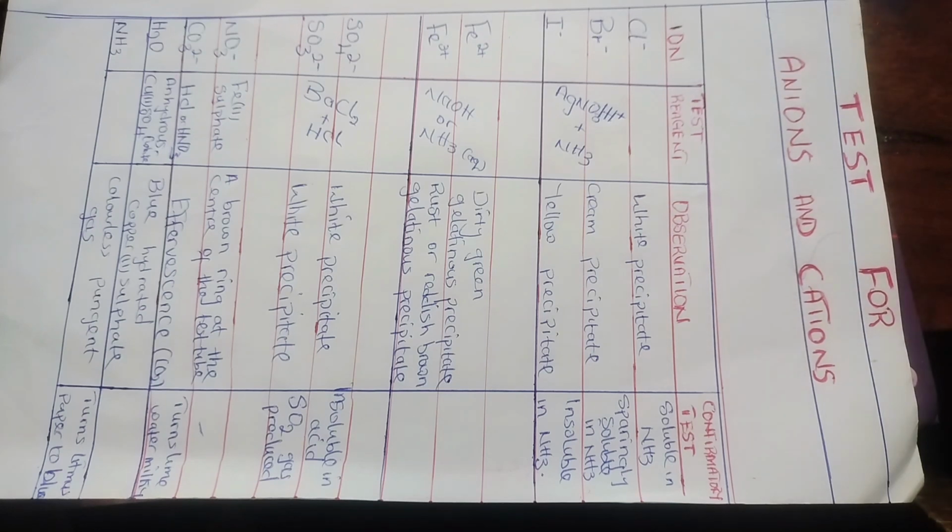After adding ammonia, what happens? After adding ammonia, the precipitate becomes soluble. The precipitate was soluble in ammonia. They can give information about the solubility of the precipitate in ammonia. If they say the precipitate was soluble in ammonia, you know that it is chloride.